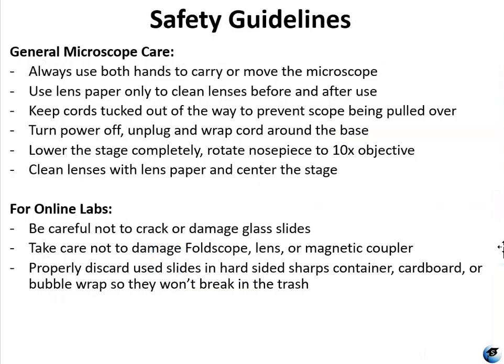As far as safety, there really isn't much in this lab that is hazardous, but you do need to know general microscope care. And as far as what you're doing specifically, you want to be careful not to crack your glass slides. Be careful with your Foldscope, especially when you're assembling it. You don't want to tear it. Take care not to drop or crack the lens or the magnetic coupler that comes with it.